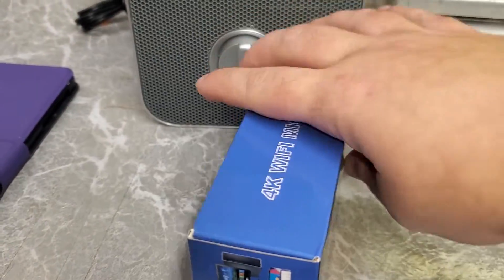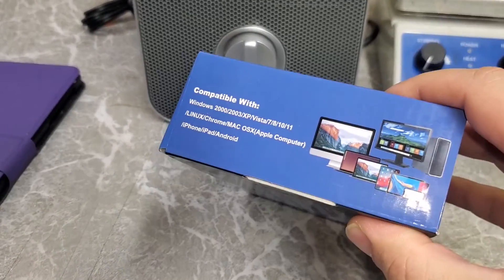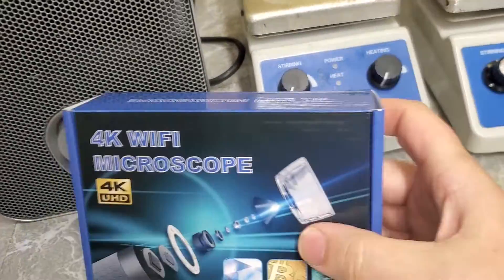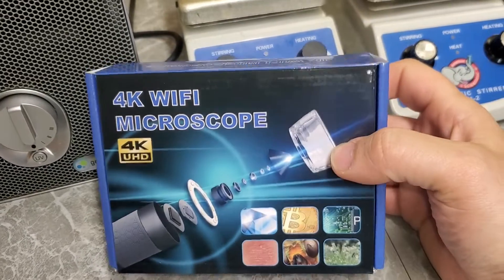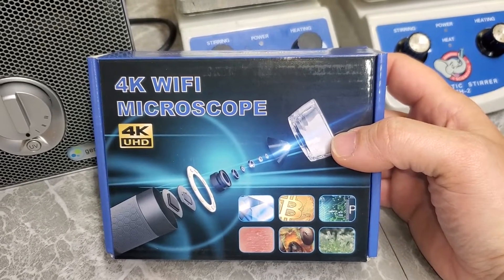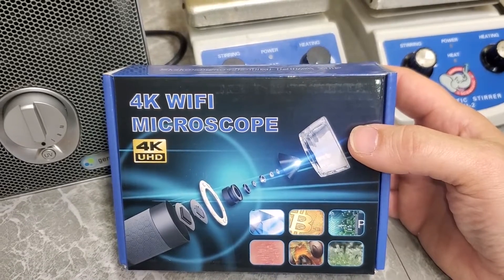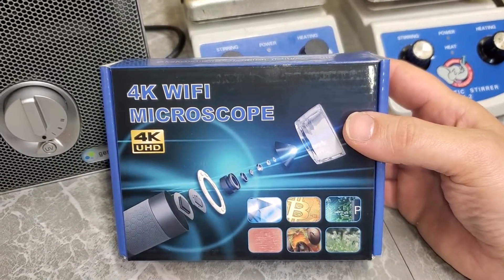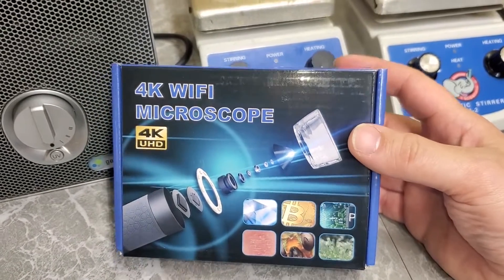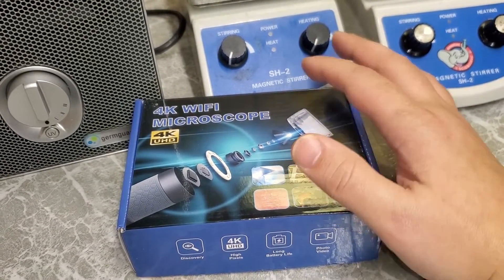It just says '4K Wi-Fi microscope' everywhere — there's no real branding on the box at all. That leads me to believe this is one of those products that's mass-manufactured by a certain company, and then other companies purchase it and rebrand it under their own name. That's fine, there's nothing wrong with that. It's a way to keep costs down. Chances are if you buy this from a different vendor you'll probably get something exactly the same or very similar.